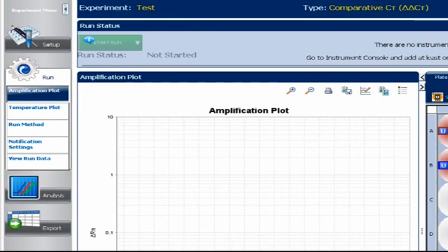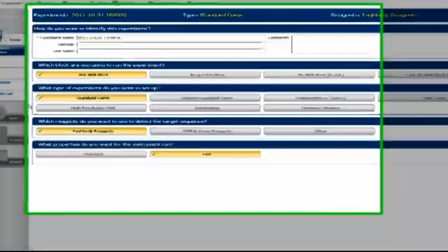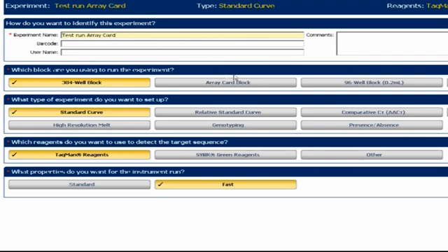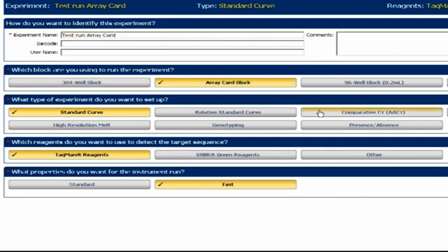That's the manual process for a run using individual assays. Let's see the same process for TaqMan array products, either cards or plates, since the workflow is more automated. From this screen, choose Array Card Block as your instrument block type. As before, choose Comparative CT as the experiment type.